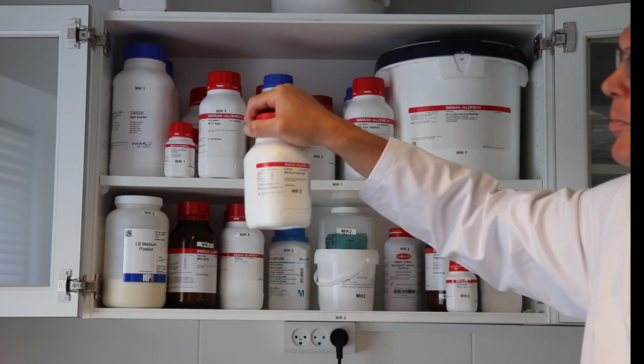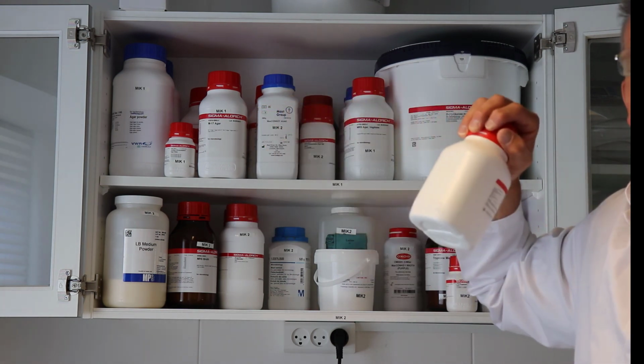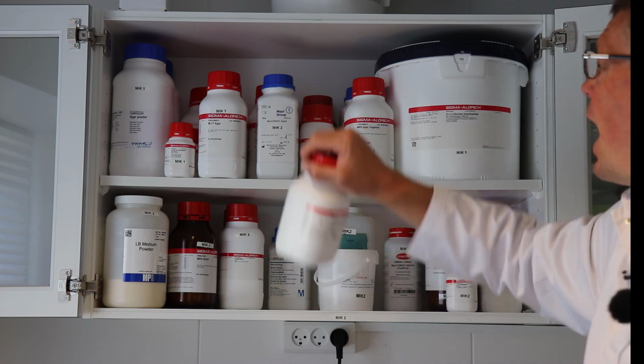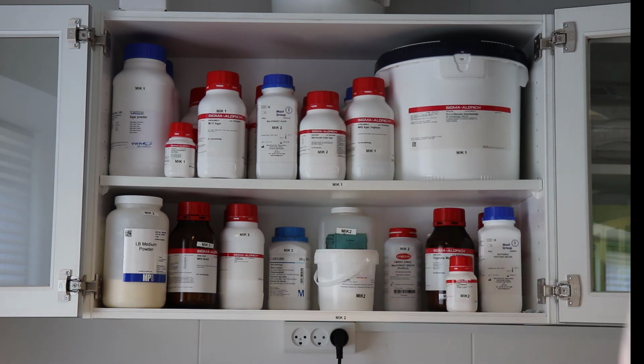We have the bile esculin azide agar, which will detect fecal streptococci, meaning streptococcus from the feces, and a lot of other types of agar, which can be used and usually used when you have some kind of idea from the visual inspection, using the microscope, biochemistry and so on.